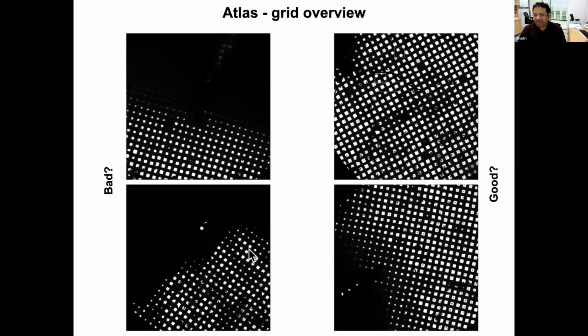But remember that in the data collection, you just need 1 or 2 grid squares. So here you have so many grid squares. All you do is maybe collect only these 3 or 4 and you are done. You can get a lot of data in it. So even if this doesn't look good, if your squares are good, then that's enough to get good data.